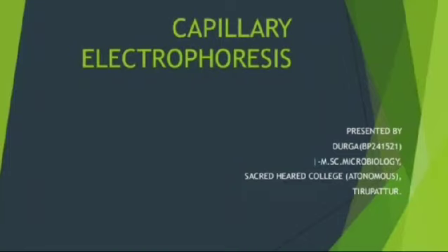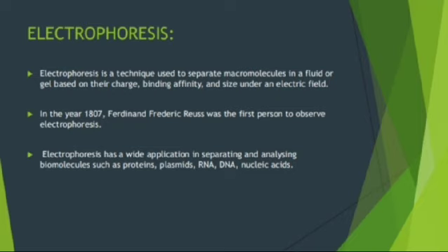Today we are going to see about capillary electrophoresis. First, electrophoresis. Electrophoresis is a technique used to separate macromolecules in a fluid or gel based on their charge, binding affinity and size under an electric field.